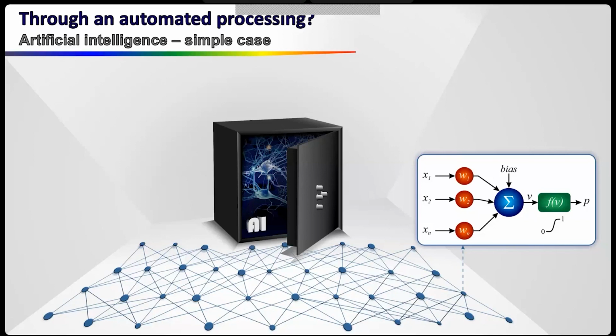And we want to identify different minerals in this sample. So basically, an artificial neural network. I'm sure that you are familiar with this. Each neuron is a simple operation, and then you make the sum, apply a bias, and you go through an activation function that is sigmoid here.